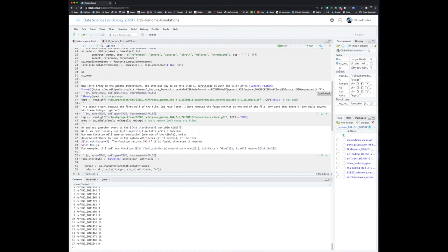Actually, I just figured it out for this class when I was putting it together. It's really confusing, and I think that I need this package called ape from CRAN. This is some kind of file format reading. If I load that library for ape, I think it's been installed in your session by the time you clone lecture 12 at the RStudio Cloud. It should be accessible to you. And I'm going to try to read it in with this function called read.gff.